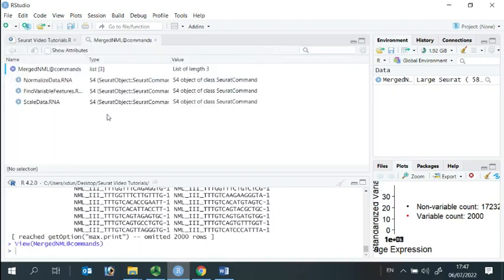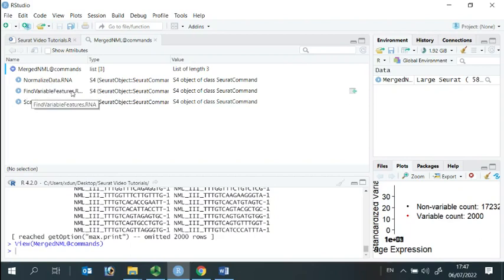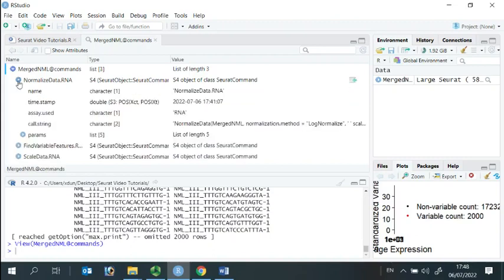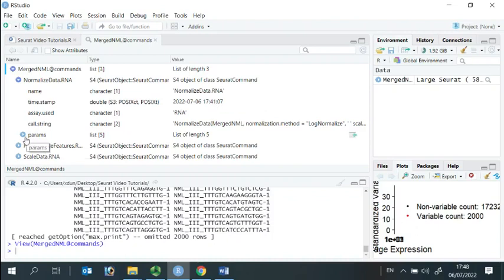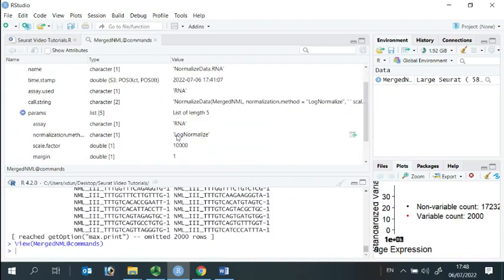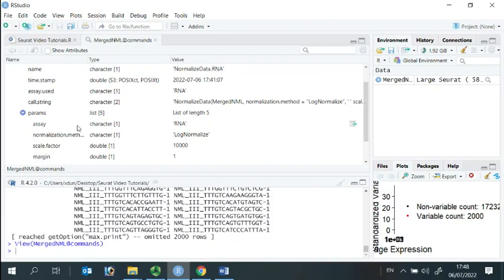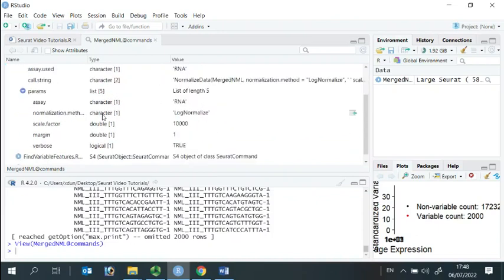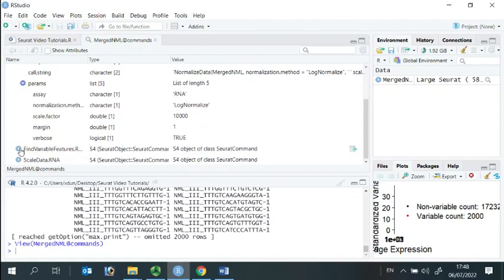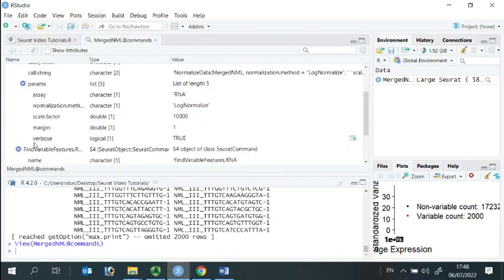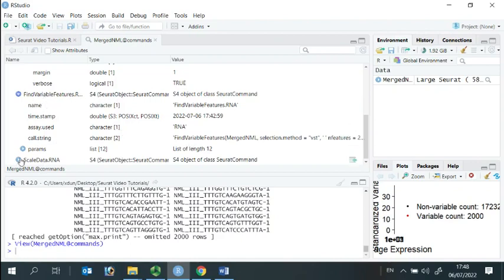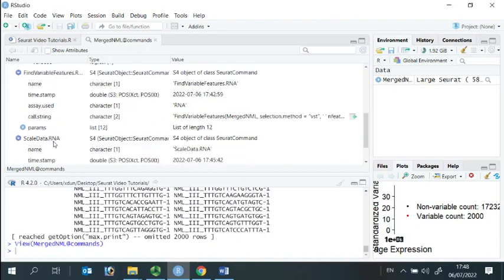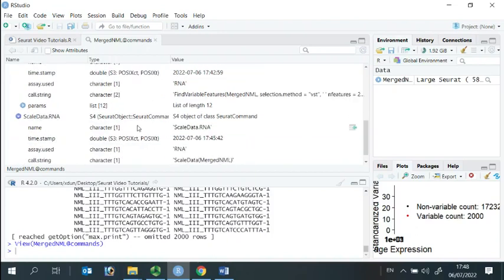If we look at the commands list again, now you can see we have three commands in the commands list: normalize data, find variable features, and scale data. It also shows when we performed the analysis, what kind of method and scale factor we used for this function. It looks the same for find variable features and scale data.